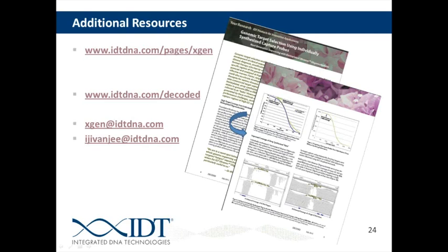So, for example, if you have a 200 kilobase supplement size, and your overall capture panel is 1 megabase, you would need 0.2 times 13 picomoles. Sorry, my math is terrible in my head, but we probably don't need the exact number.